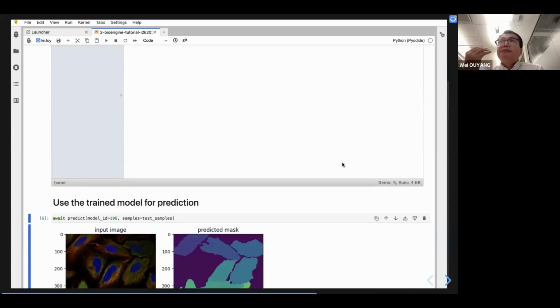If you have a larger-scale cluster with Kubernetes, that's even easier. We have a package called Helm Chart, right? Helm Chart is similar to a pip package for Python, but for Kubernetes. So you can do a Helm install command. We are working on that.